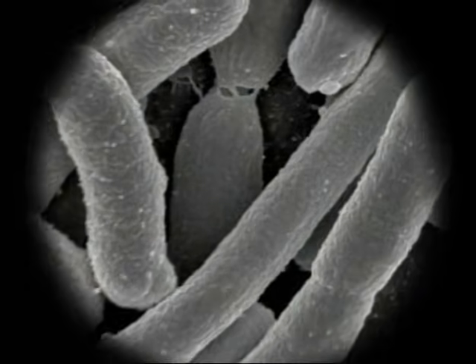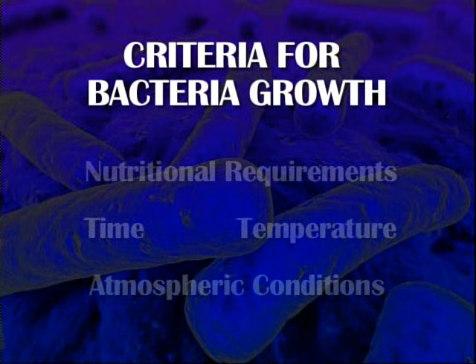To do that, we have to see those organisms, and we can see them in two ways. One way is microscopically, like the microscope that I have behind me, using 1,000 power magnification. The other way is to grow those organisms. Bacteria don't grow in size, they grow in number. One bacteria divides into two, two into four, four into 16, and they grow exponentially over a period of 6 to 8 hours. After that period, they start to produce byproducts and they begin to die off.